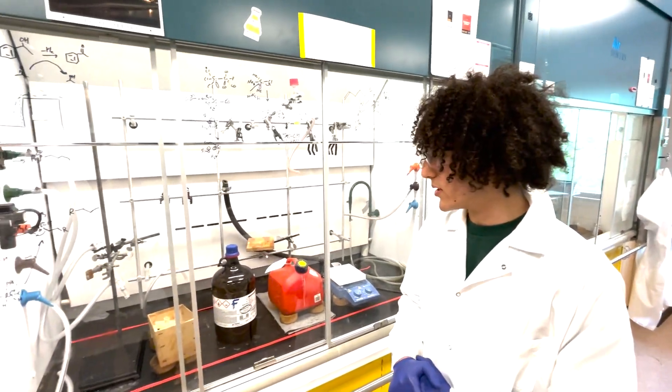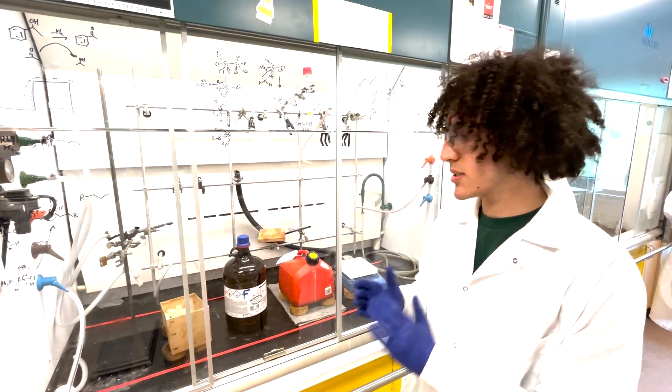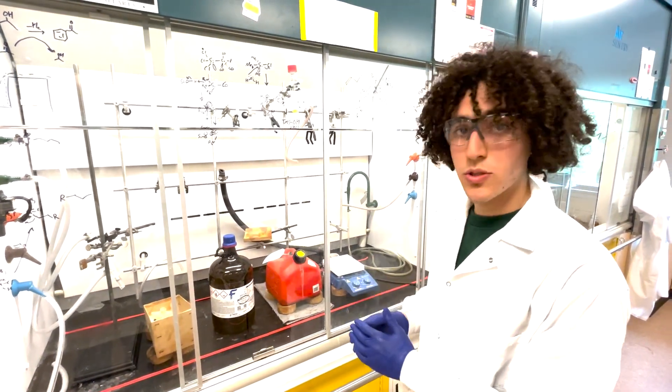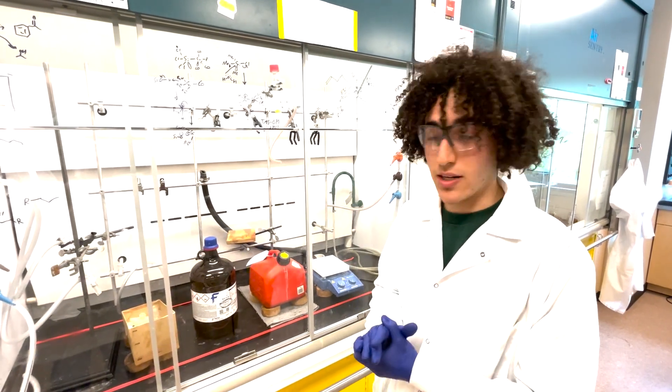Additionally, it is inappropriate to use a fume hood as a waste disposal tool for volatile reagents, as these fumes will enter the atmosphere untreated which is dangerous.